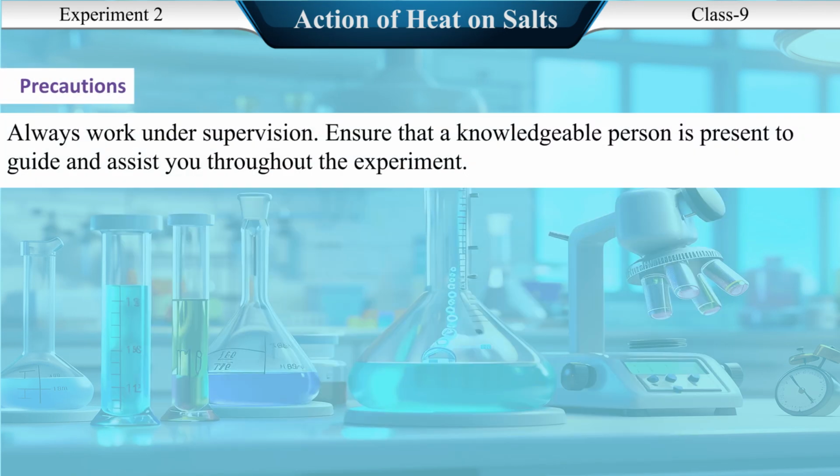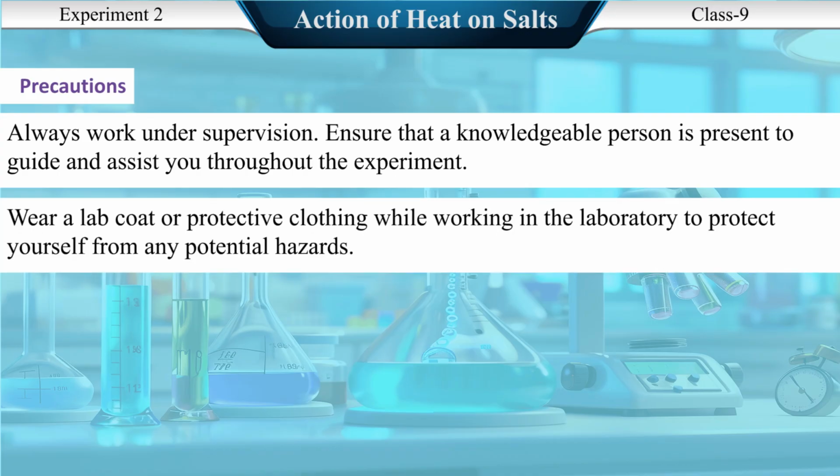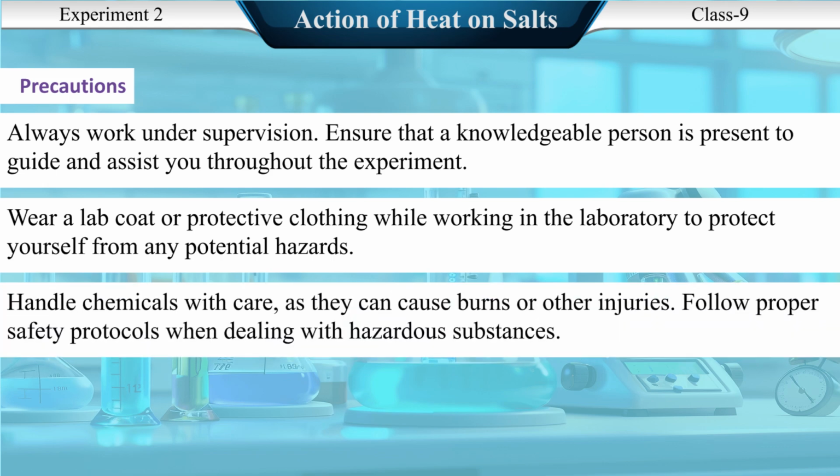Precautions. Always work under supervision. Ensure that a knowledgeable person is present to guide and assist you throughout the experiment. Wear a lab coat or protective clothing while working in the laboratory to protect yourself from any potential hazards. Handle chemicals with care, as they can cause burns or other injuries. Follow proper safety protocols when dealing with hazardous substances.